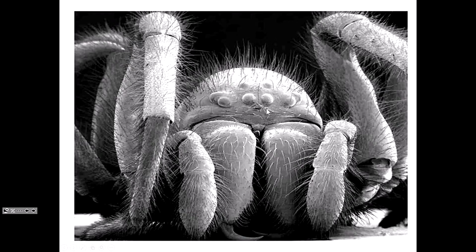But again, you can see it's got like 6 eyes, and it's got hair all over its legs and structures like that. So you can really appreciate the fine detail of what these small organisms or cells and tissues look like with scanning electron microscopy.